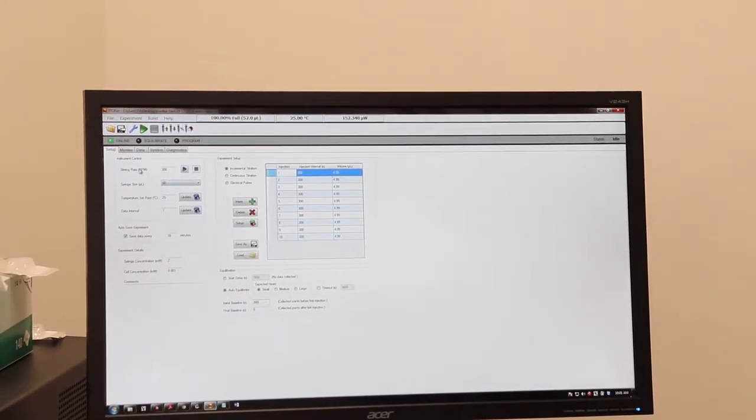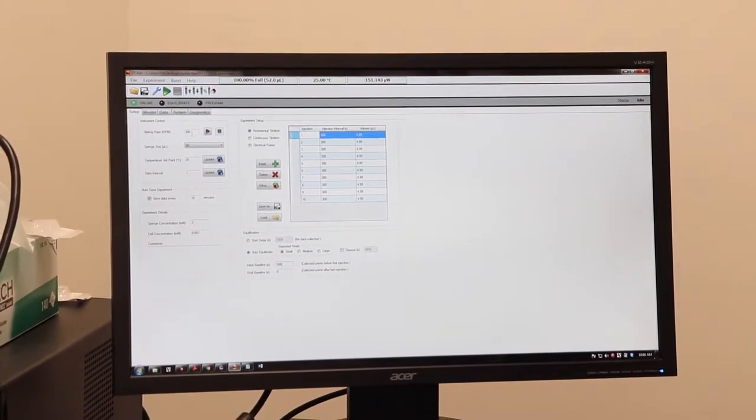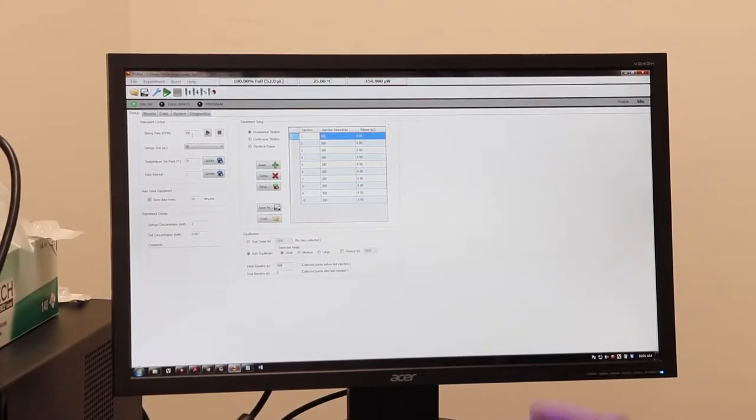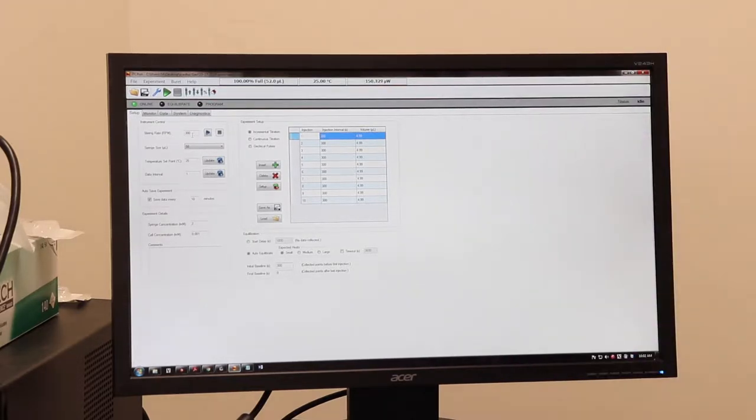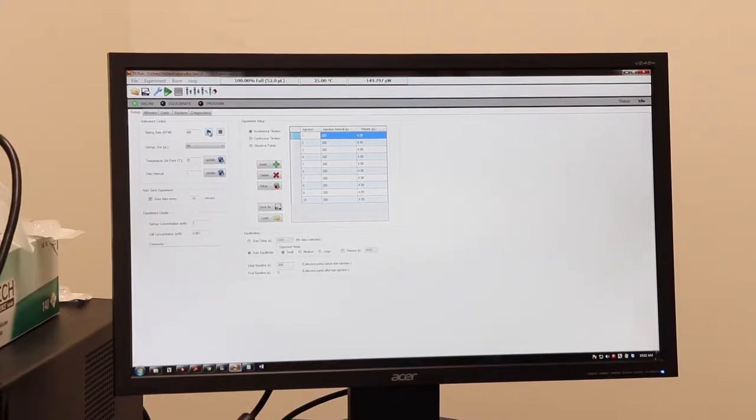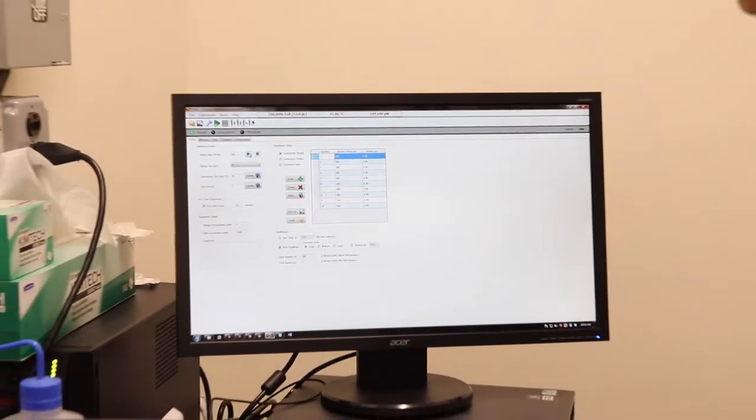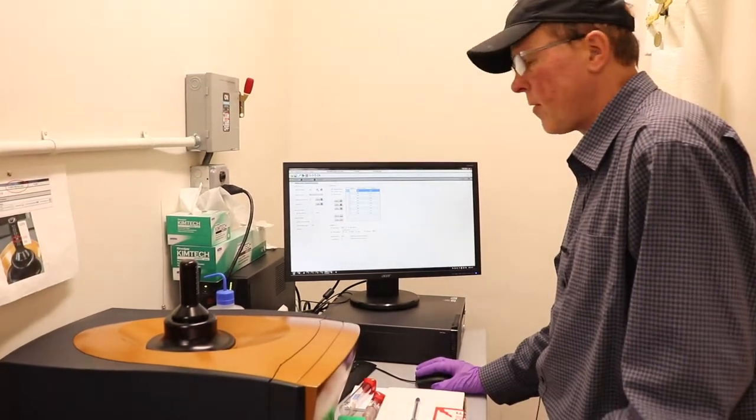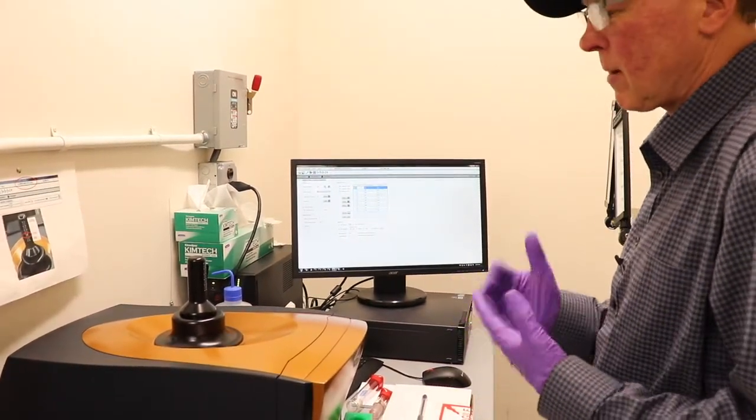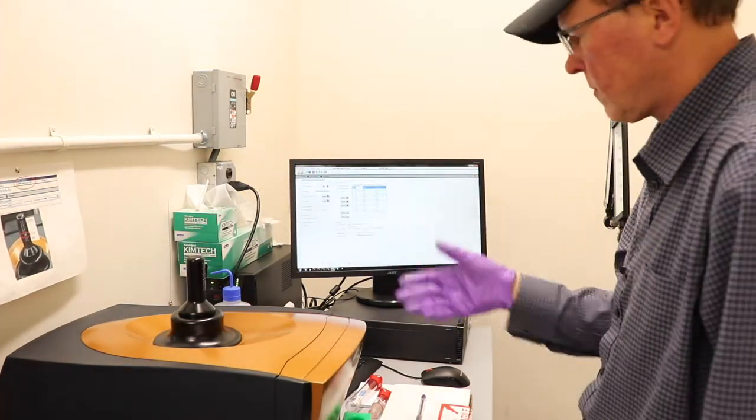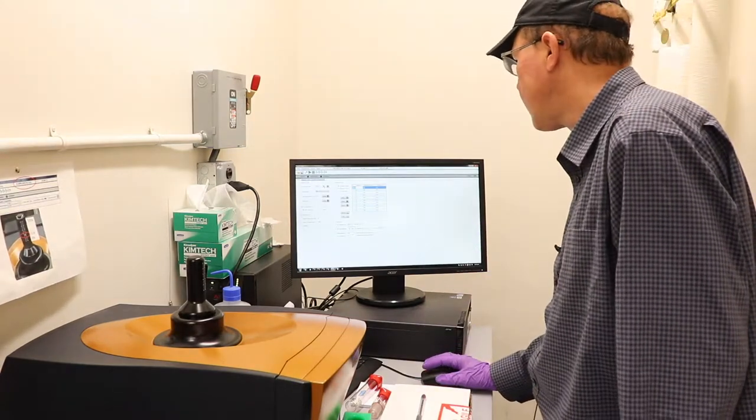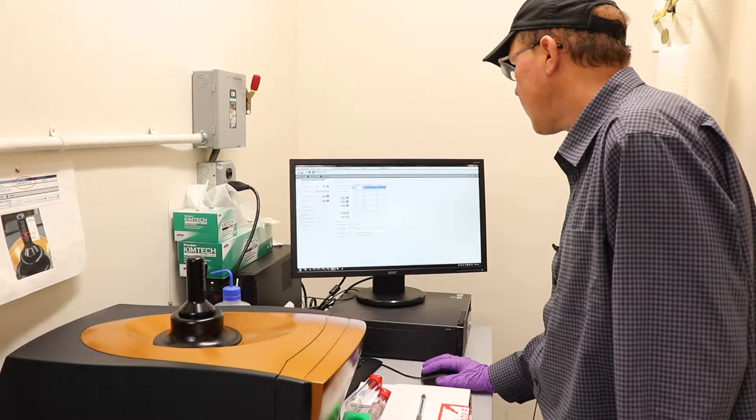Okay. So we're almost ready to go. You want to turn the stirring on. So as far as RPM, it's either 300 or don't turn it on. Other values are just not good for the motor. Don't do that. The newest version of software doesn't have that option. So we'll start the stirring. And if we listen to this, it's a little surprising the first time you hear it. But that's how it's supposed to sound. If it continues to make a much louder noise, that means the burette holder is not in there correctly. Stop it and start over.